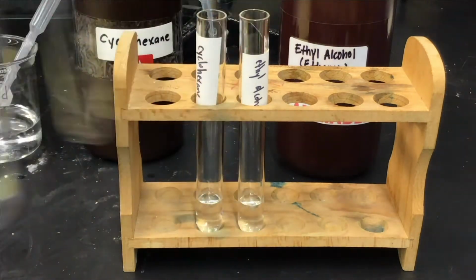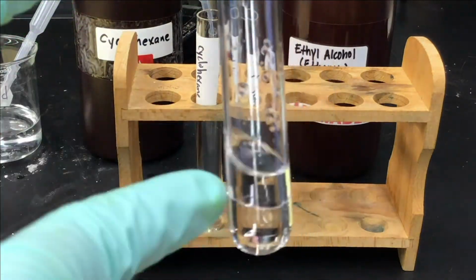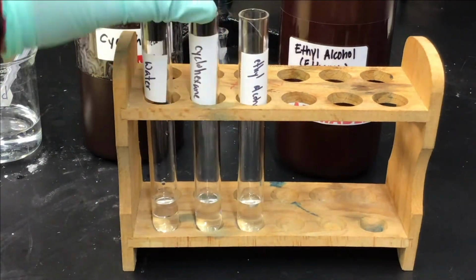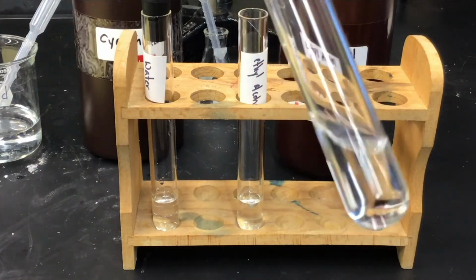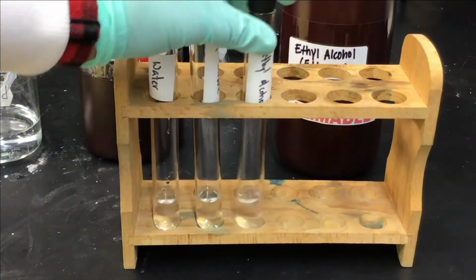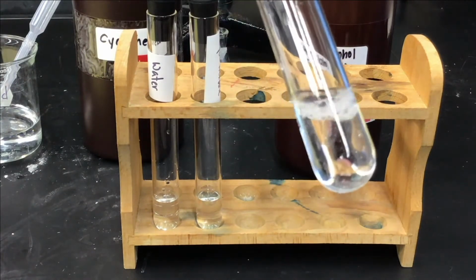Just like we saw with toluene, our unknown C creates 2 layers when added to water. When we shake the test tube that has cyclohexane and our unknown liquid, we get a clear, colorless solution. When we shake the last test tube with ethyl alcohol and our unknown, we get a clear, colorless solution.